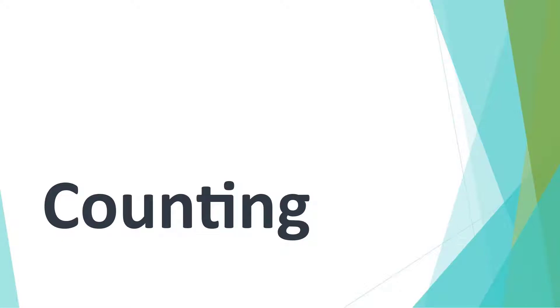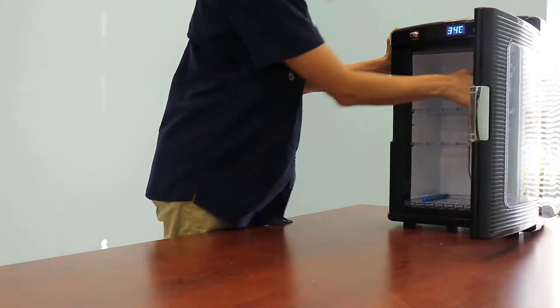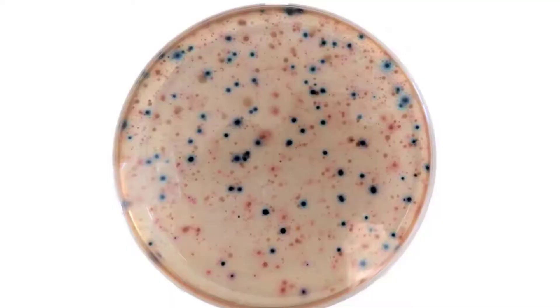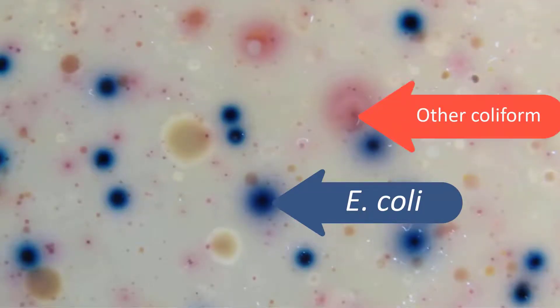After incubating your samples for 30 to 48 hours, remove the plates from the incubator. If there was E. coli or other coliform bacteria in your water sample, you should see small blue to purple and pink to dark red dots on the plate. These are bacteria colonies. You may also notice an unpleasant smell.